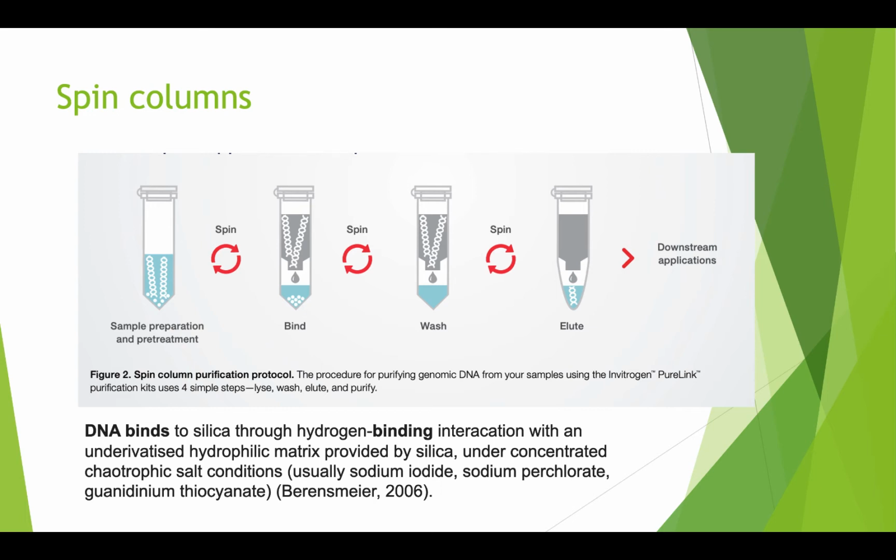The only thing that you might really find is that this is through hydrogen bonding interaction with an underivatized hydrophilic matrix provided by silica. Really, we don't know until now. But we just know it. DNA binds very, very strongly to the silica for some reason.